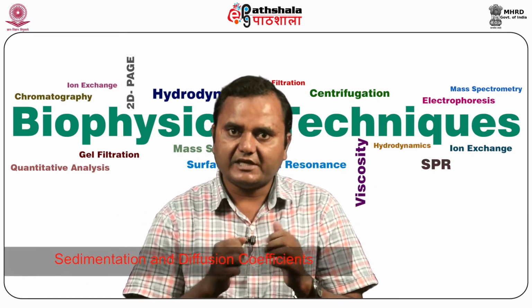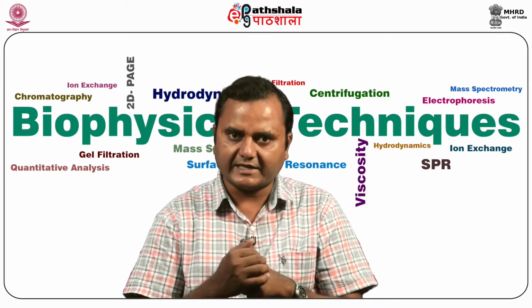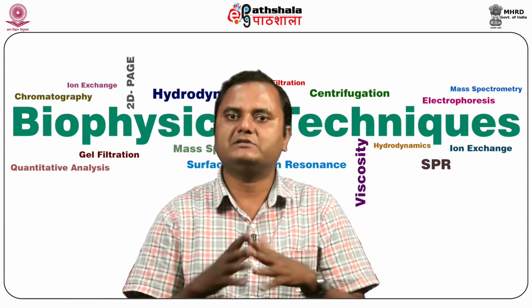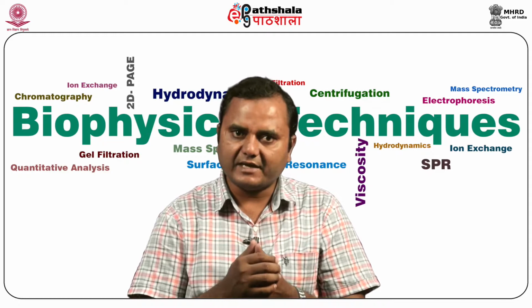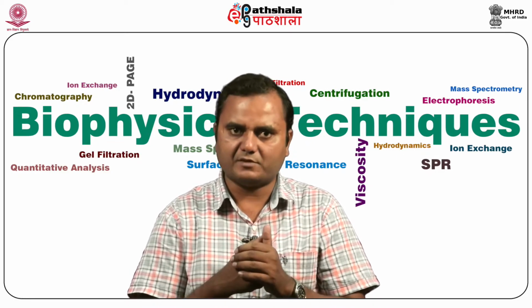Then the sedimentation and diffusion coefficient measure the macromolecular complex size and interaction, that is, how big the complexes formed are, and in the reverse way, how the complexes are broken into the different components. This technique is also utilized for ligand binding studies to distinguish ligand from the acceptor by differing absorbance.